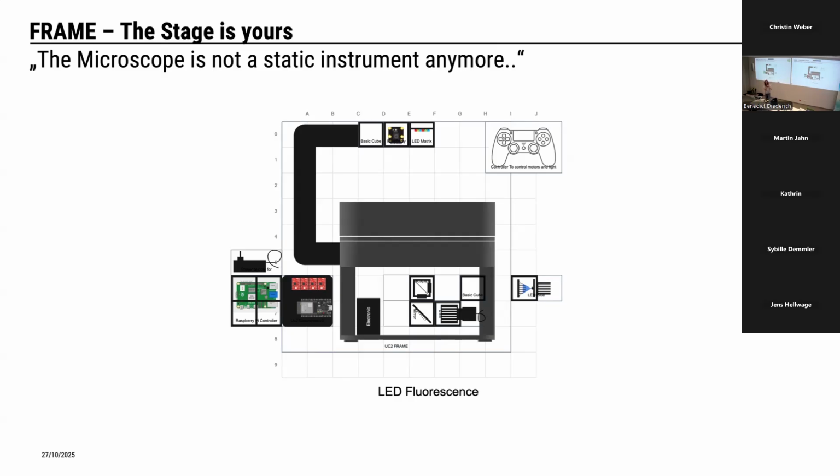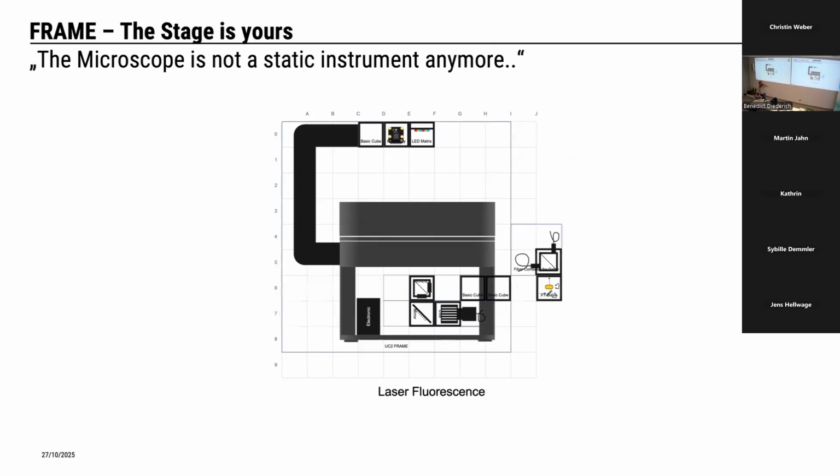So the idea is that you polarize the light linearly, and then with an analyzer, you filter out the nonlinear component from the polarized light. And so with these two components, you can already build a cross-polarization microscope to detect, for example, birefringence in stress of plastics. And that's what we try to do, I guess, here. And you see the function or the imaging modality is only dependent on the inner cube or the cubes you are surrounding it with.